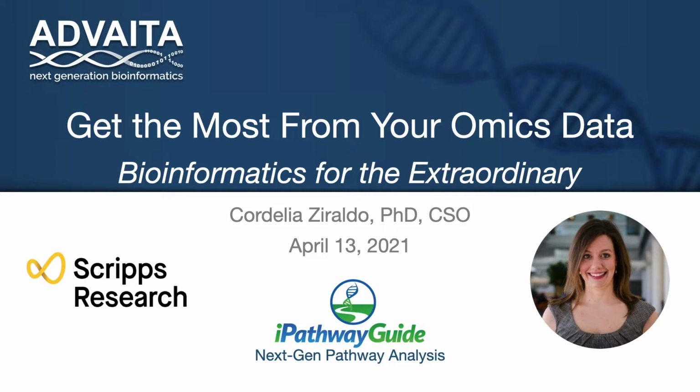Today's topic is get the most from your omics data, maximize your pathway analysis with iPathwayGuide.